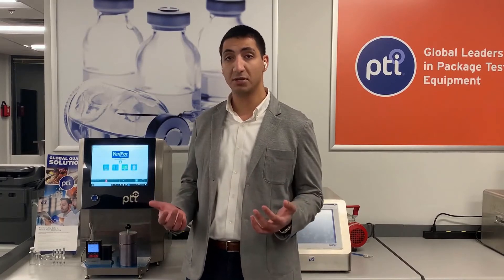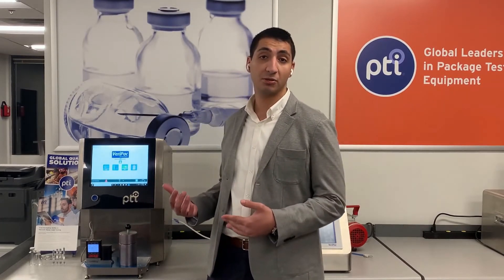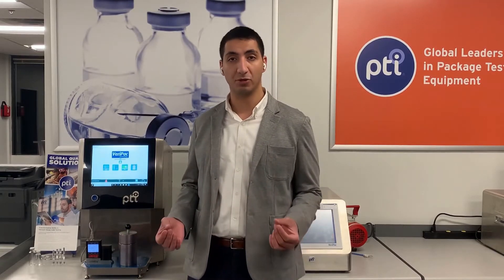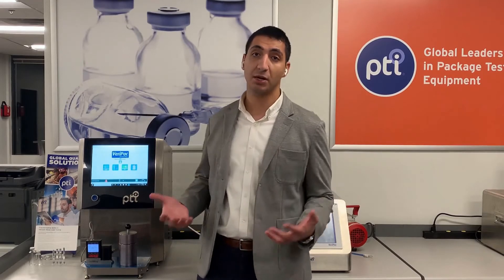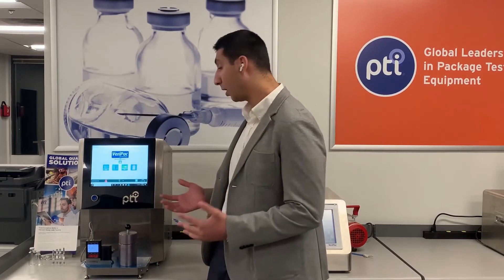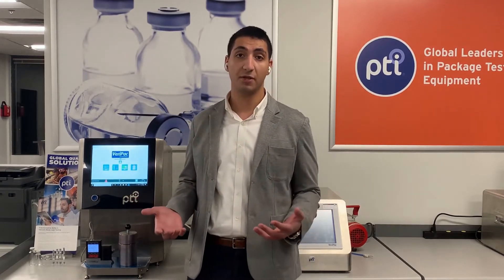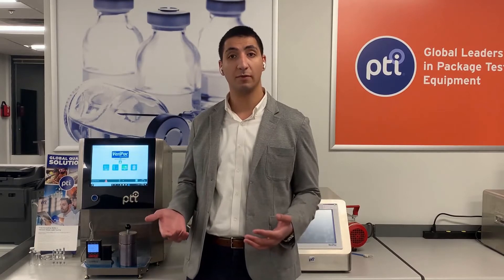The VeriPac 465 technology is based on basic principles of physics and doesn't require the use of any trace gases. It'll provide data and results that are quantitative and repeatable, without the need for any sample preparation. The technology is based on ASTM's vacuum decay leak test method F2338-09, and this method was actually developed using PTI's VeriPac product line. The method is also an FDA-recognized and USP 1207-recommended test method for package integrity testing.